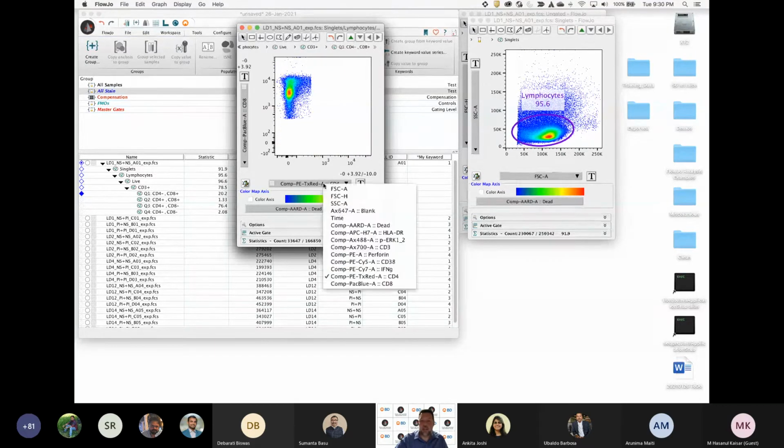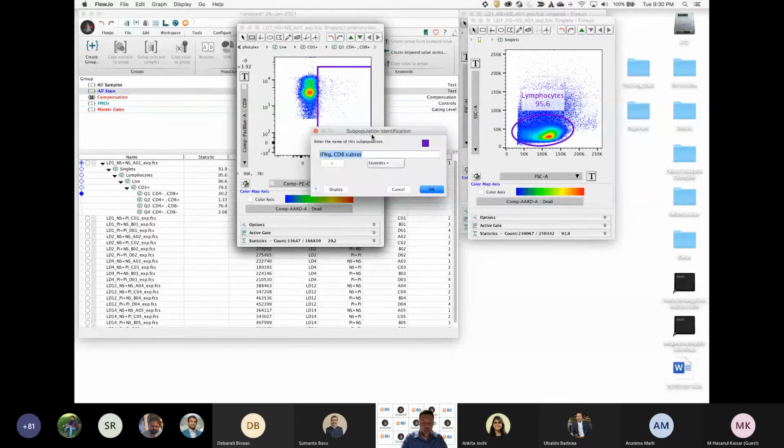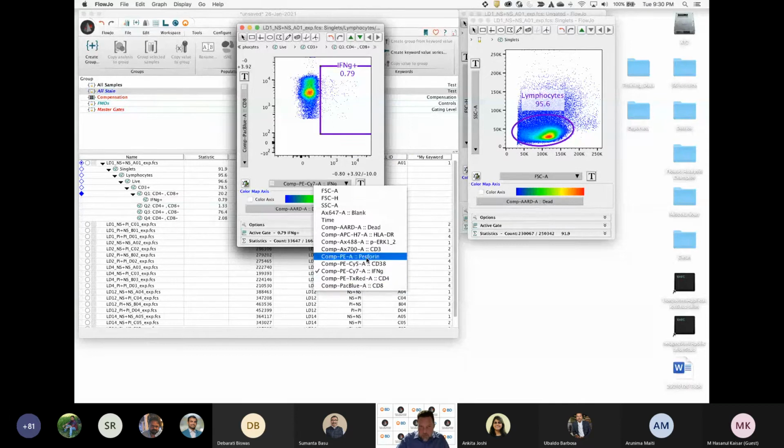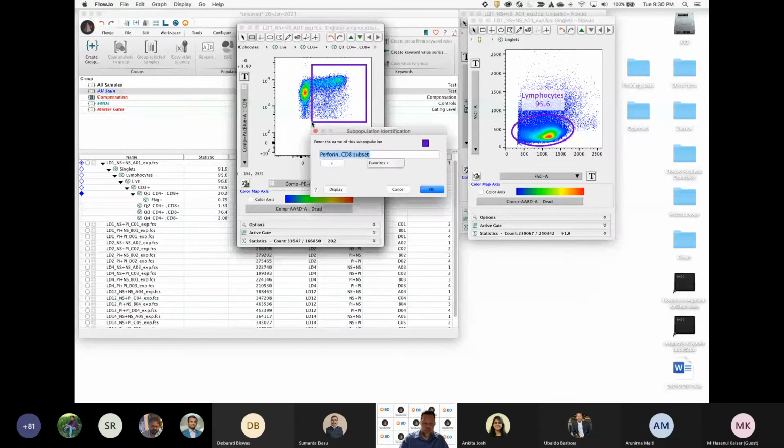and then I'm going to double click on the Q1 CD8 population, and I'll just gate my individual markers. Here's interferon gamma. This is an unstimulated sample, so you don't see much gamma yet, but we'll see it once we start applying these gates to the group. So I'll just make a gate here called IFNG. And I can always resize that or move it. I'll go to my perforin marker next. That's the perforin expression within the CD8s. Again, define the positive fraction called perf positive.